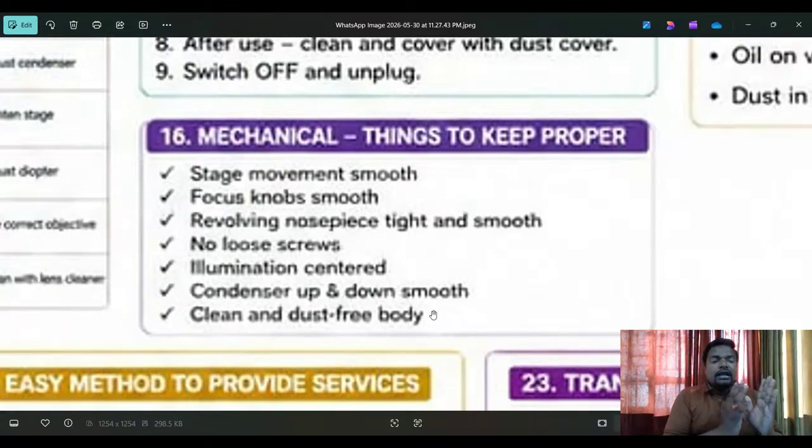So laboratory equipment is one way. Three months will be there, quarterly will be there, yearly will be there, depending on the condition of the equipment. And if you regularly communicate, then definitely you will get more information. Why is preventive maintenance very, very important?